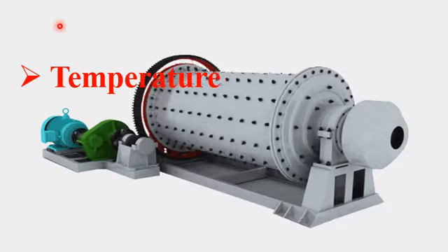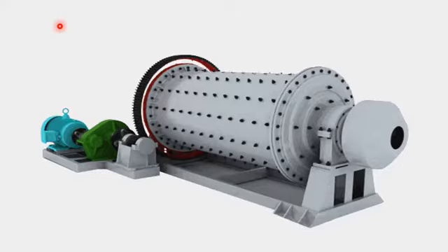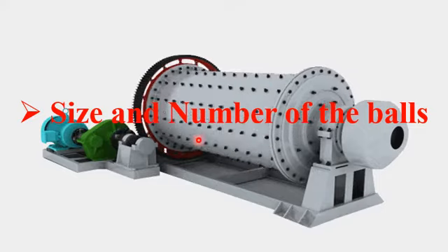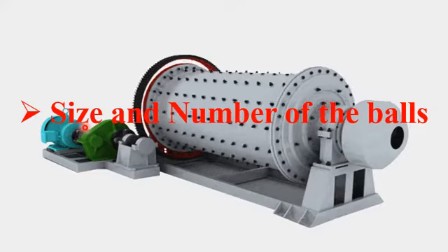Another key physical parameter associated with the ball milling process is the size and the number of the balls. The size and the number of the balls in the ball milling process play a vital role in order to get very fine nanoparticles or nanomaterials.